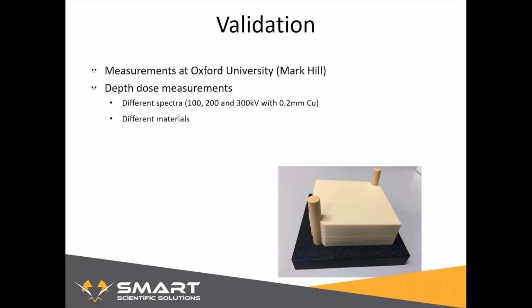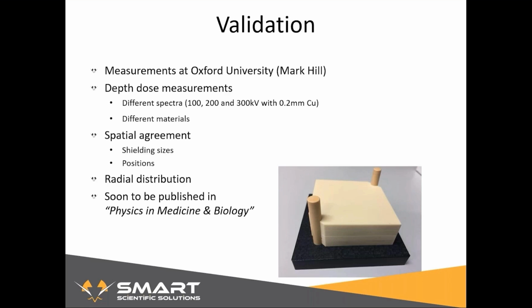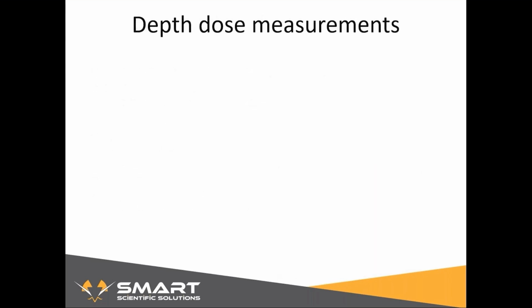Then we also tried two different materials, plastic water and bone. That was tested for spatial agreement. This was done using different shielding sizes and positions. And then also the radial distribution was evaluated. Hopefully soon it will be published in Physics in Medicine and Biology. It is in the last phase of the review. I will show a segment of the depth dose measurements. Showing all the results is a bit too much for this presentation.